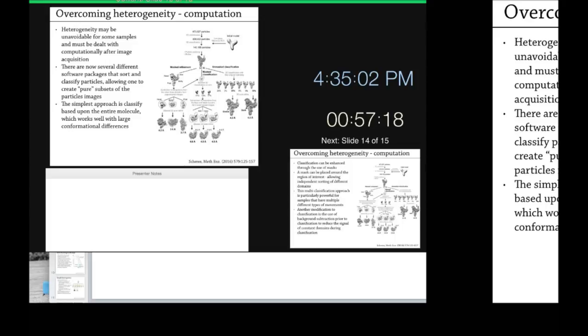And so you can manually set it to 3.75, 1.875, or if you really want to kill your computers, 0.09375, whatever it is, and run your 3D classification that way, where you're sampling an enormous number of very subtle angular differences, but those may be able to pull out the conformational differences that you need. And so with this, they were able to calculate a reconstruction where they had a closed portion here versus an open portion here.